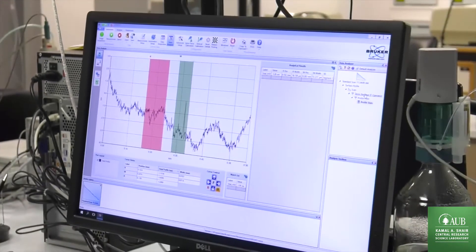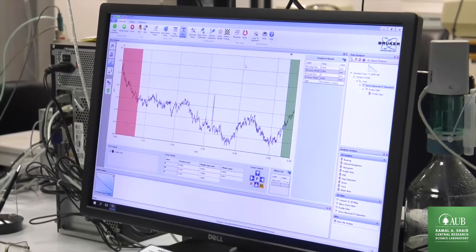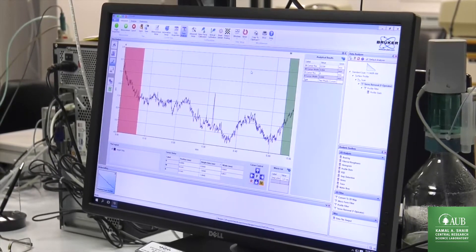And I see that the leveling is pretty good. And I, let me do it again, it is done.